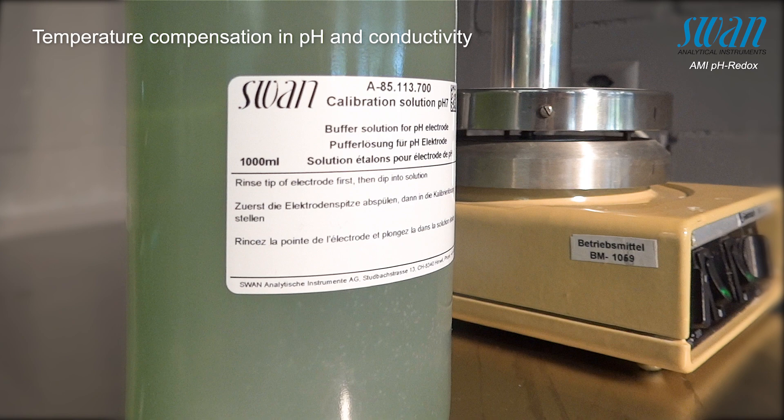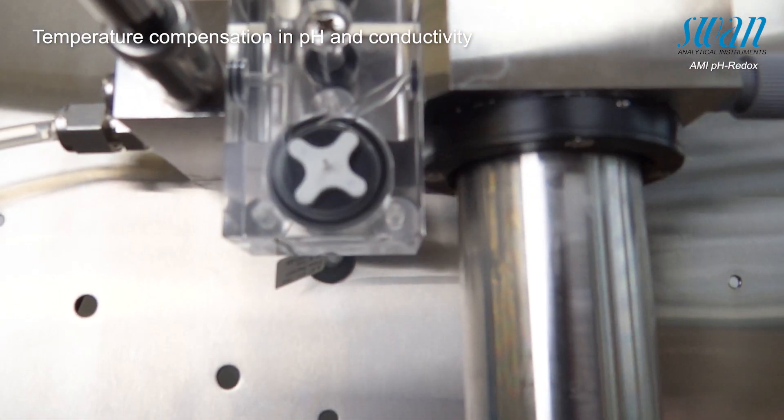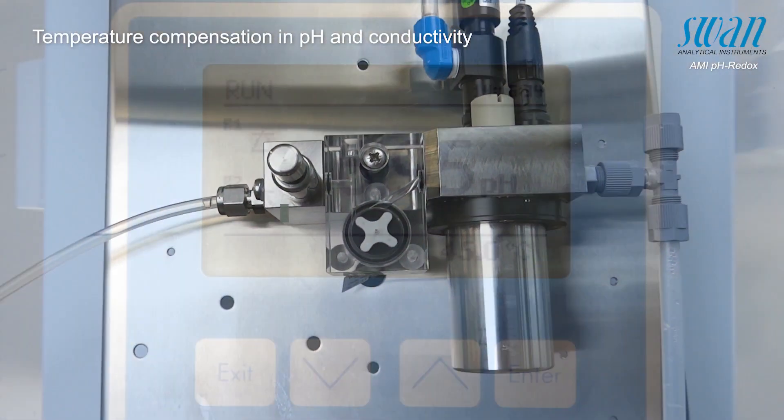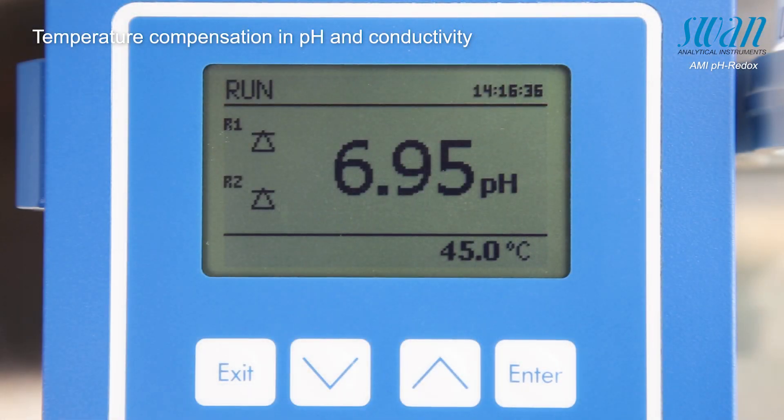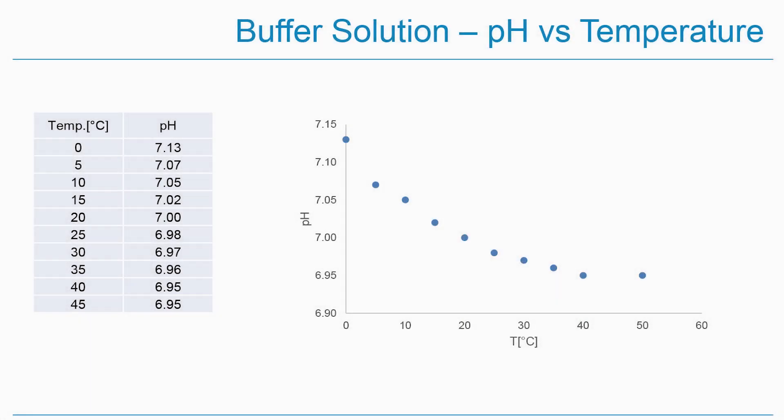To demonstrate how this temperature compensation works, a pH 7 buffer is heated to 45 degrees Celsius, after which the temperature changes and pH value are continuously measured as the buffer cools down. This chart shows how the pH value of the buffer changes relative to the temperature without compensation.